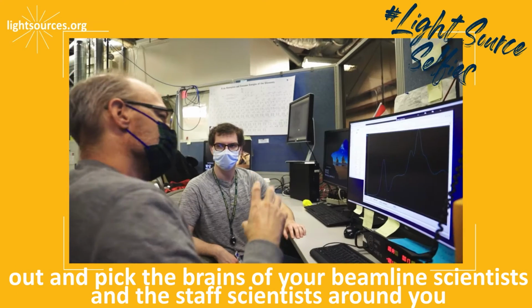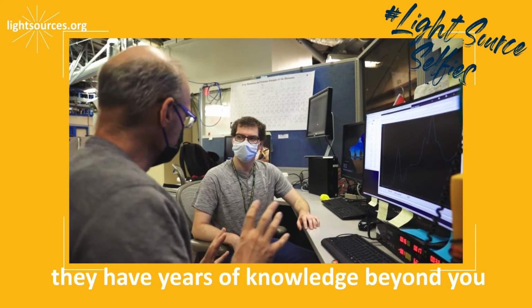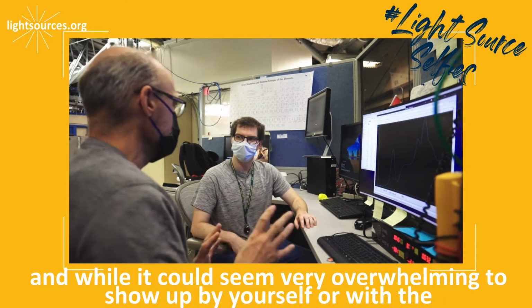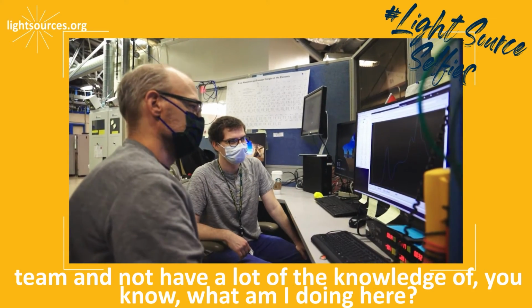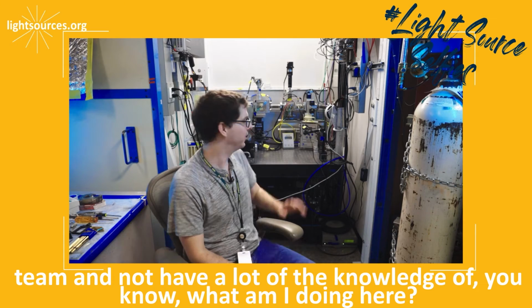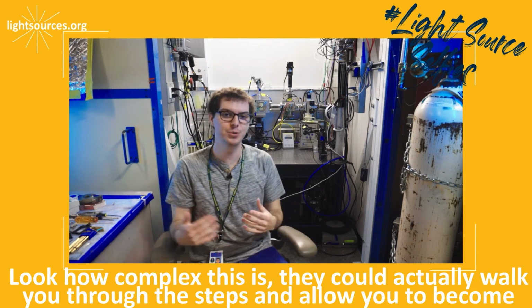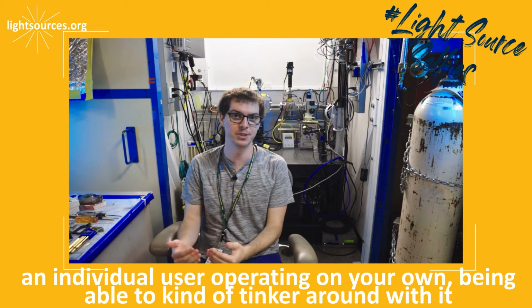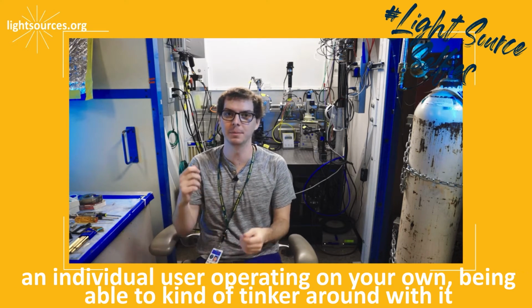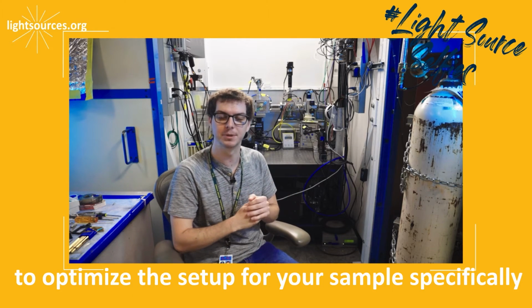A lot of the things that I would recommend to newer users at light sources is to reach out and pick the brains of your beamline scientists and the staff scientists around you. They have years of knowledge beyond you, and while it could seem very overwhelming to show up by yourself or with the team and not know what you're doing here, look how complex this is. They can walk you through the steps and allow you to become an individual user operating on your own, being able to tinker around with it to optimize the setup for your sample specifically.